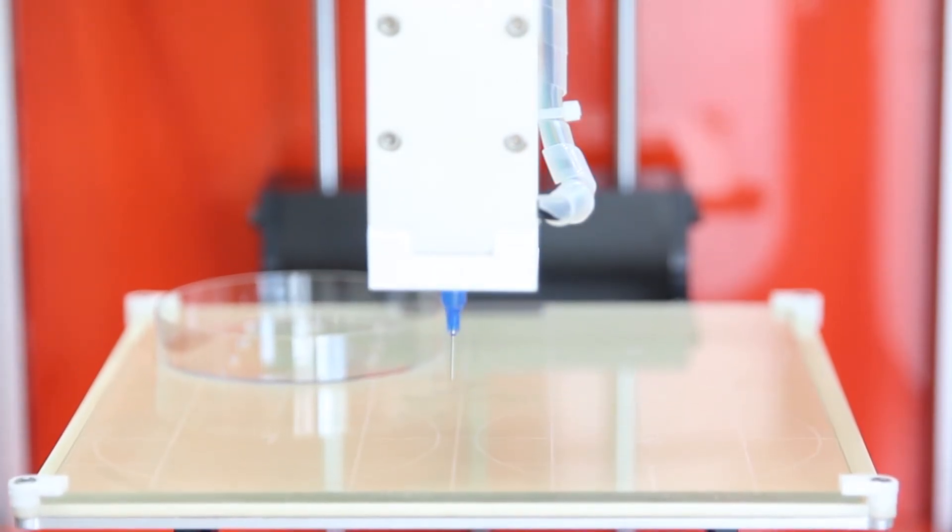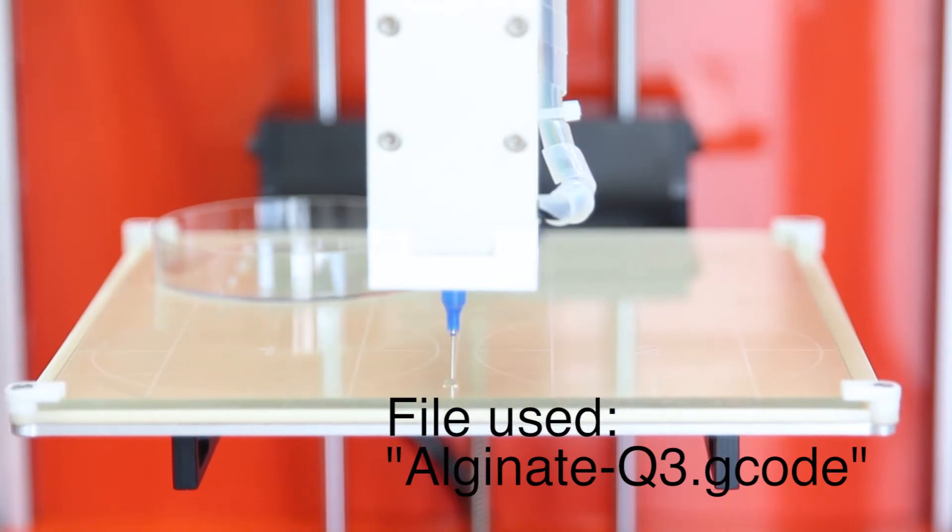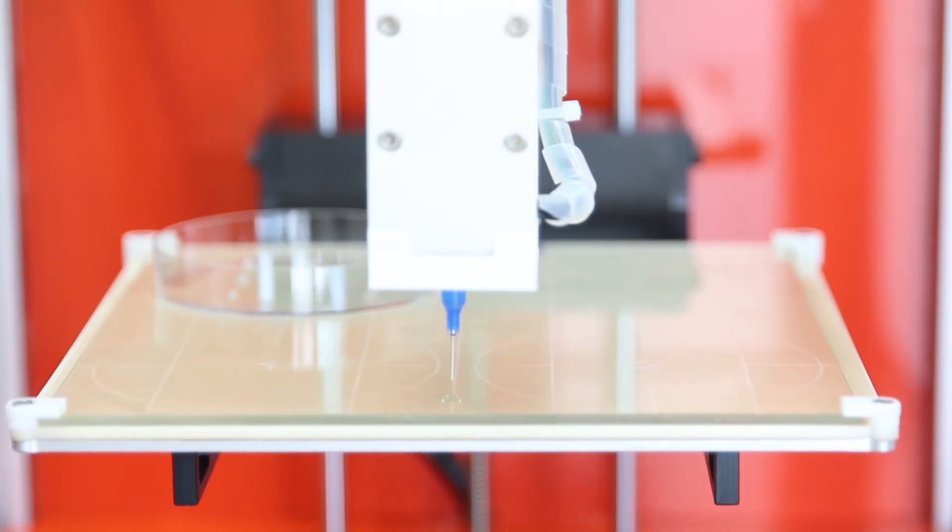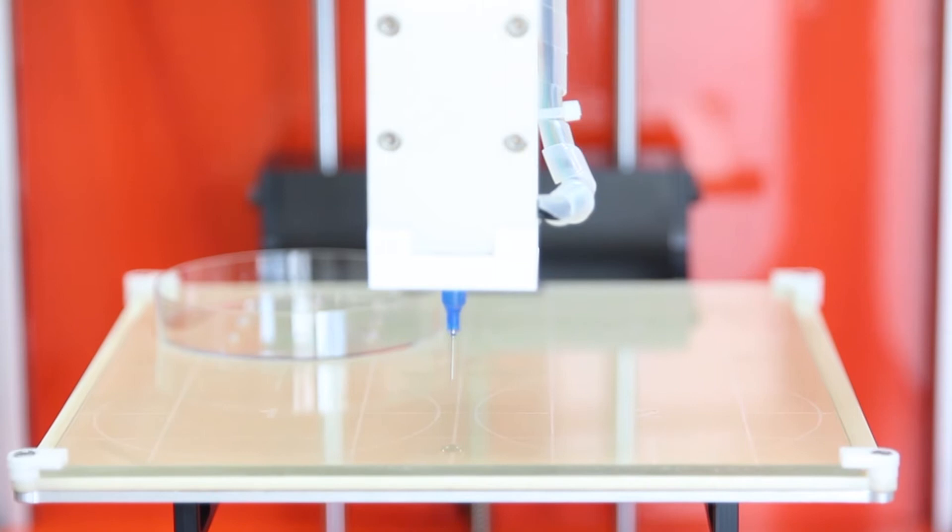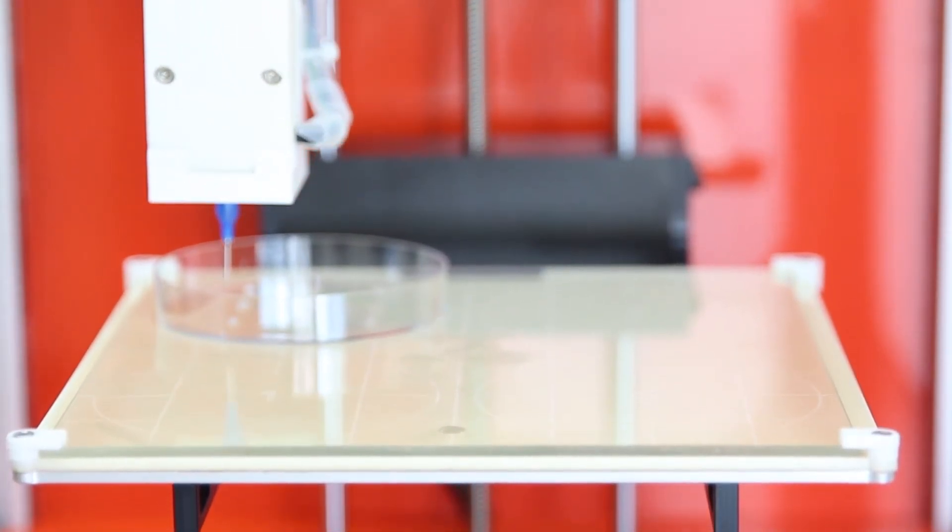Once you have done this, load your alginate g-code file and print. This will again start with the priming step, and print in the same locations as the previous 3x3 array.